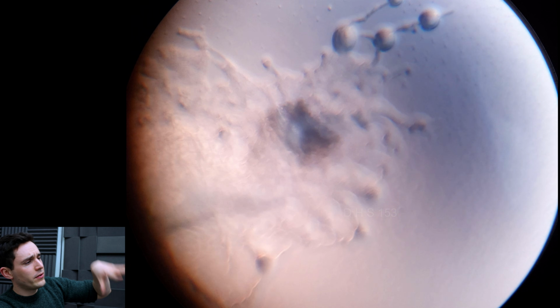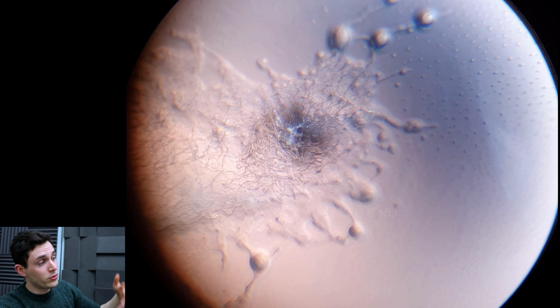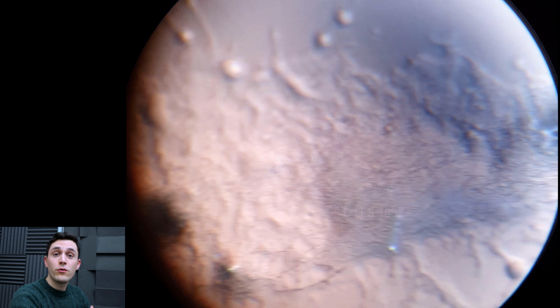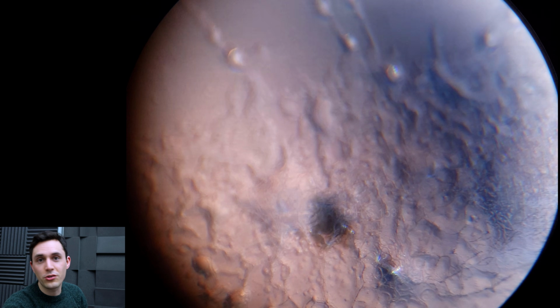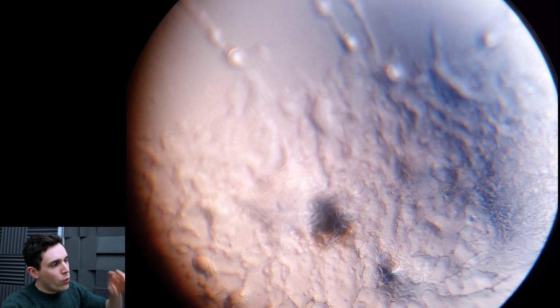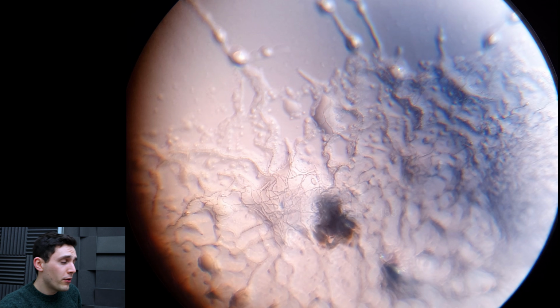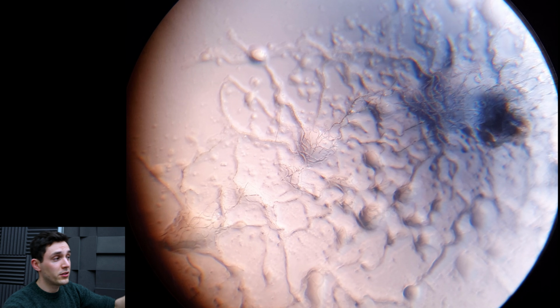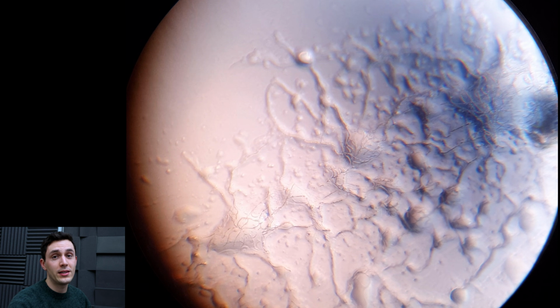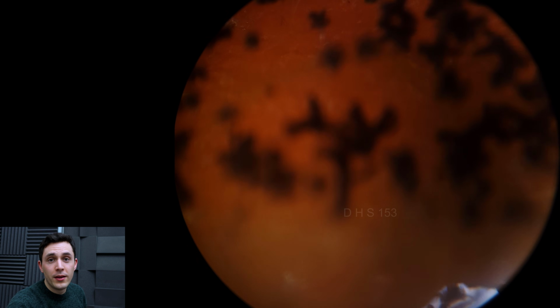So this is the type of fungus that can cause disease, and I suppose the most common would be otomycosis, oto meaning ear and myco meaning fungus, so that's a fungal ear infection. Or you would breathe these spores in, which is not necessarily a huge deal if you have a normal immune system. I mean, Aspergillus niger and fumigatus and flavus, whatever species, there are about 250 Aspergillus species in the world. It's not a problem.